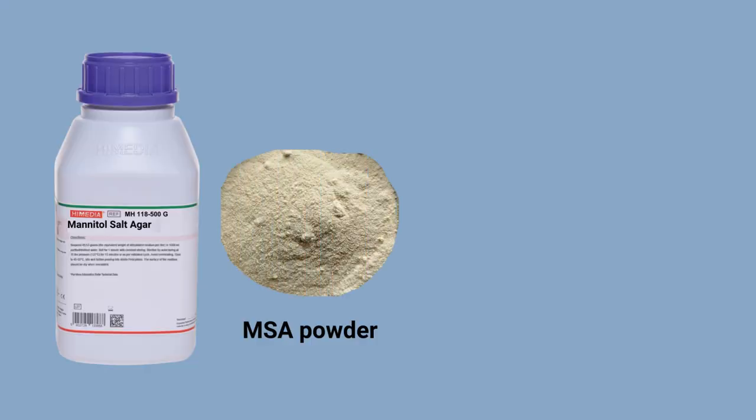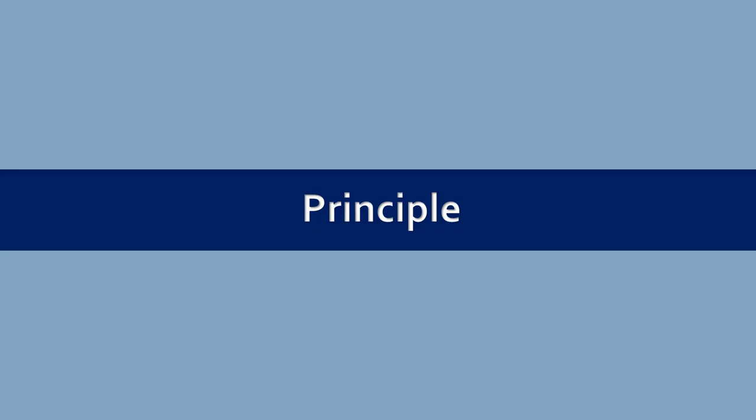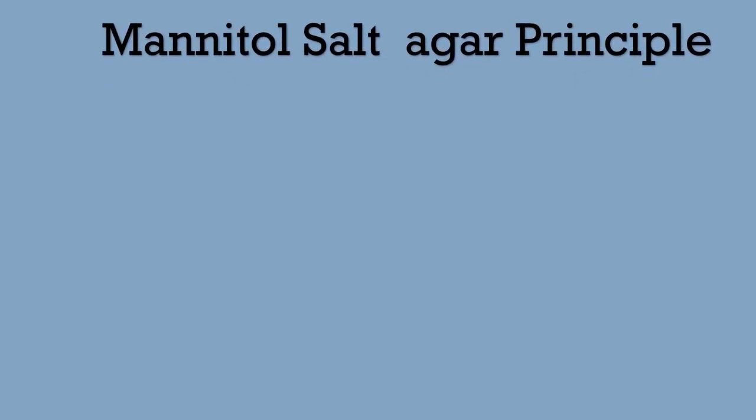Mannitol salt agar powder is used for the preparation of MSA agar plates. These plates are then used for doing the mannitol salt agar test. Now let's discuss about the principle of mannitol salt agar.